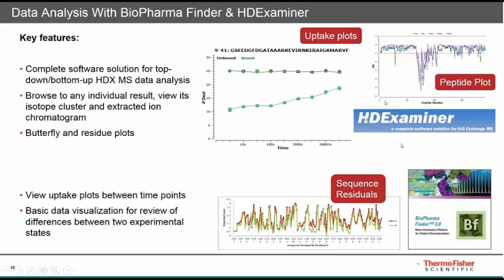HDExaminer is a third-party software package provided by Sierra Analytics, and it provides full capabilities to analyze all data, including ETD data and even top-down data.